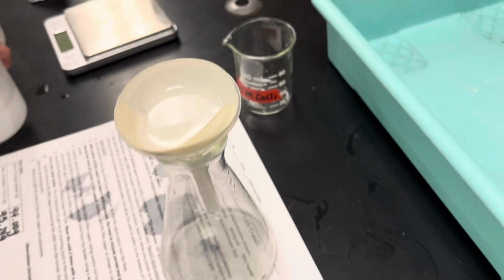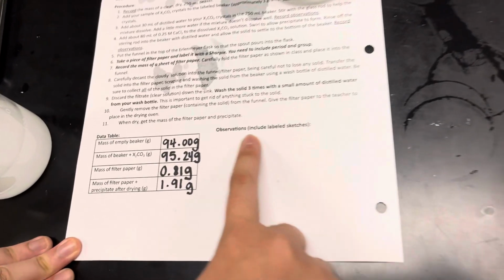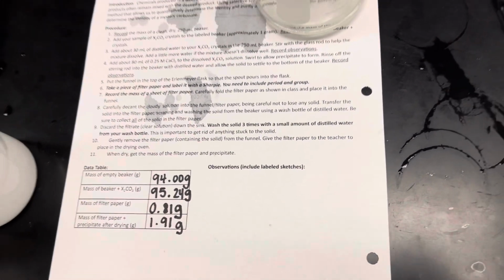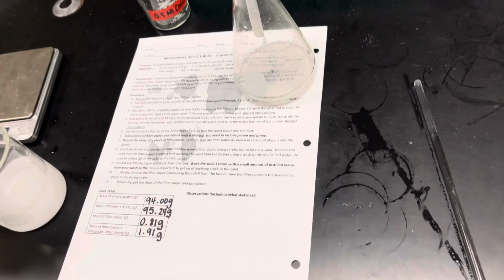So once again, now that you have all the numbers, you can continue your observations. Make sure you did some labeled sketches of what was going on. Make sure you also write what is going on, and then go ahead and do the calculations on the back in order to figure out what is the mystery X, like what is the mystery chemical.